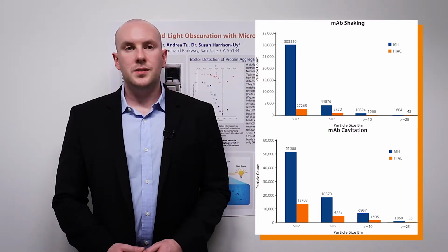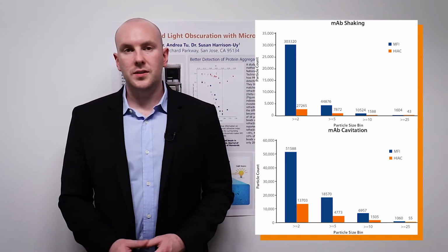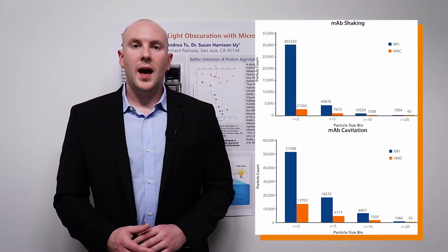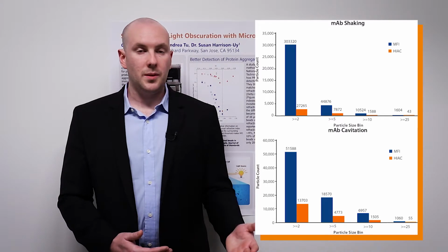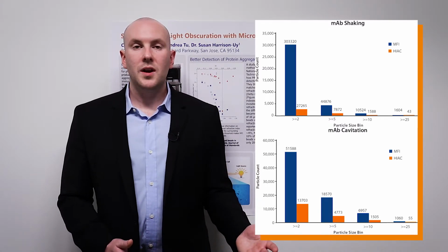microns. And you can see that for both the conditions and at all size bins, MFI measures far more particles than light obscuration does. In fact, it measures up to 10 times more particles for some of the size bins. Because of its enhanced ability to see protein aggregates, MFI is commonly employed as a formulation development tool, a process development tool, and is heavily involved in final product QC.